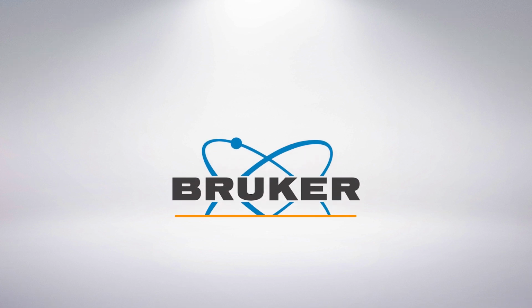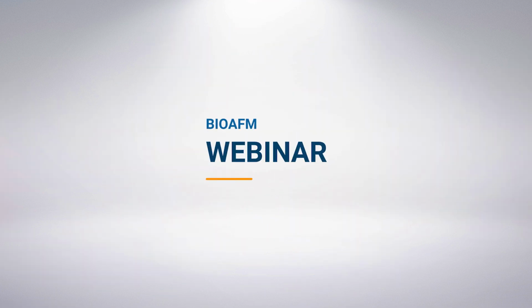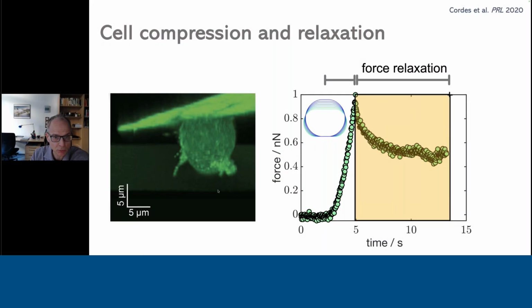The experiment we are doing is a little bit different than what I showed you. Here we have glued the cell onto a tipless cantilever so that the cell itself serves as the probe. We bring it in contact with the substrate and measure what is called the force relaxation curve. You see here the force as a function of time. At this particular point, we stop the indentation and measure just the force relaxation.